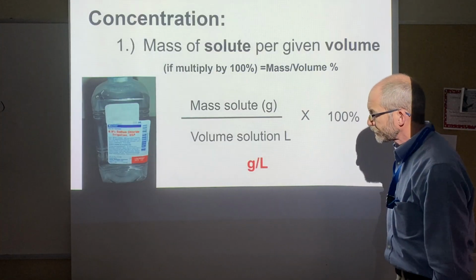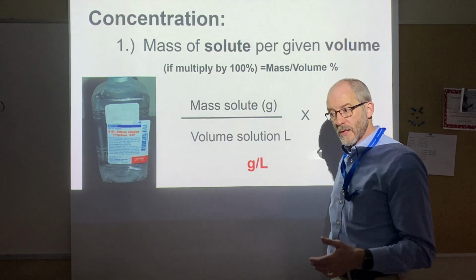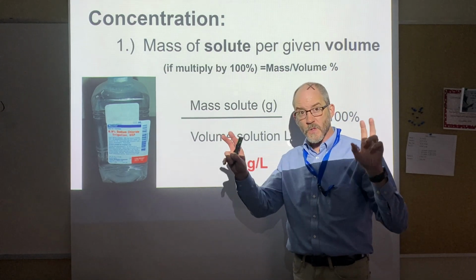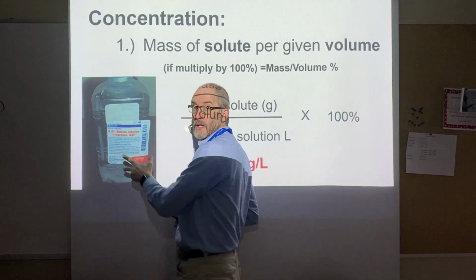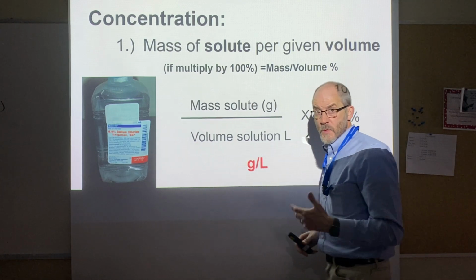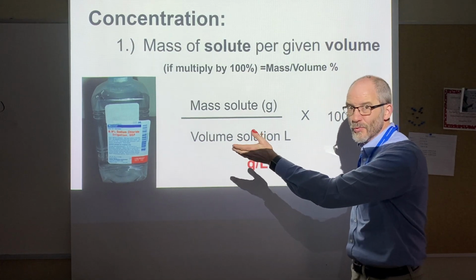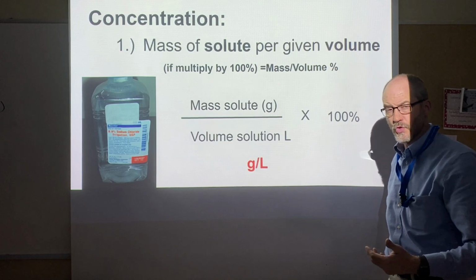So here we go. We're not going to really focus on this, but I do want to mention this first slide right here because there's more than one way to look at the concept of concentration. Here you have a bottle, and this bottle has a label on it, and it says 0.9% sodium chloride. Well, sodium chloride is obviously salt, so what are you doing here? Well, you know what you're doing. You're creating a pretty darn dilute solution at only 0.9%. That's not much of a saltwater solution.